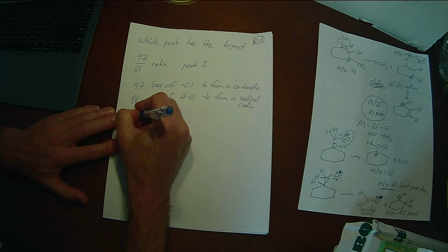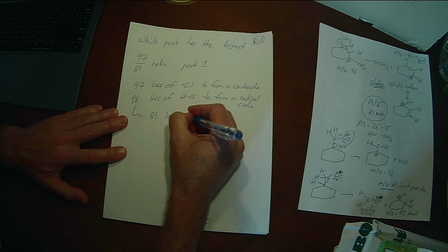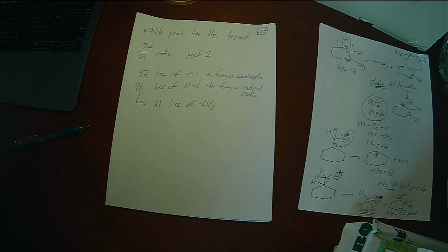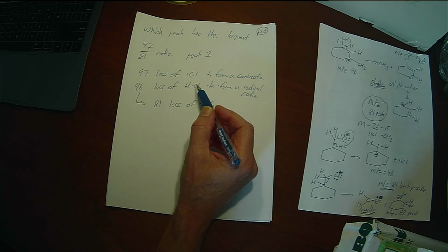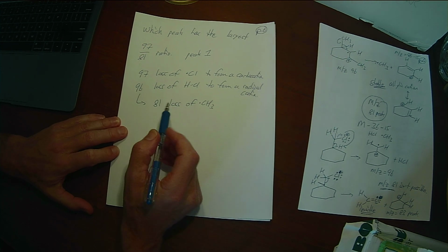And then that 96 peak is generating the daughter fragment at 81 with loss of CH3. So if loss of chlorine is pretty favorable, you'd expect loss of HCl to be relatively less favorable. Once you've lost the HCl, it's pretty common to lose that methyl group.